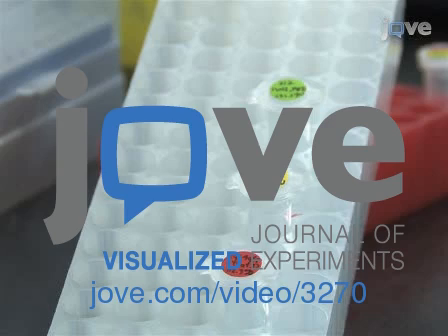Jessica Single-Portman, a lab technician in my lab, will demonstrate microinjection in Pristionchus pacificus.